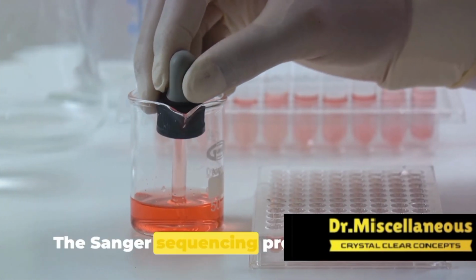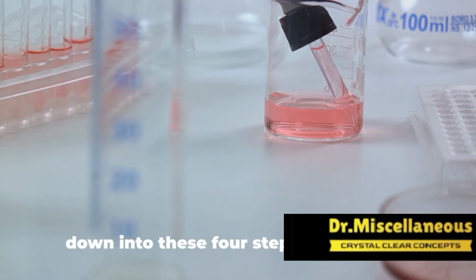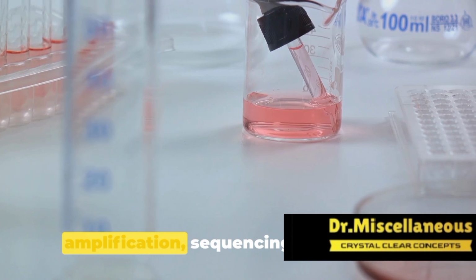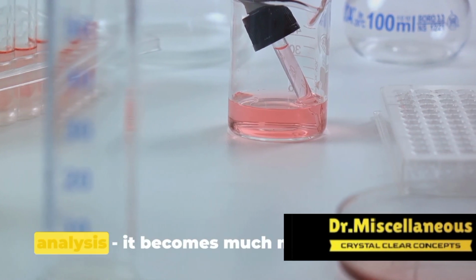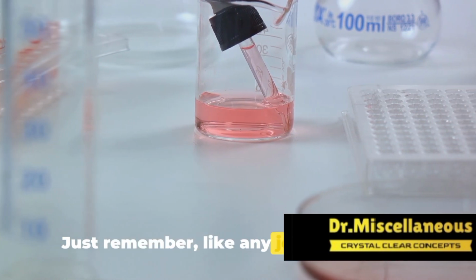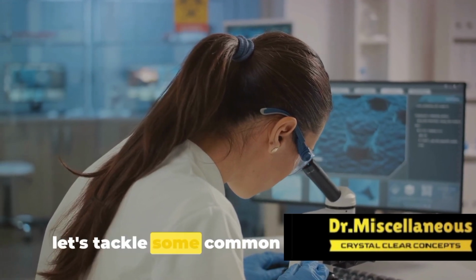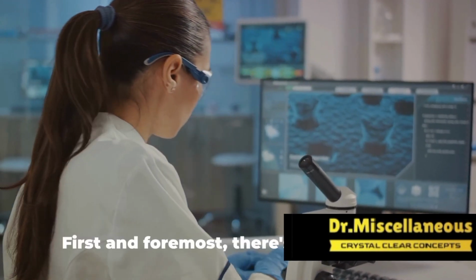The Sanger sequencing process may seem complex at first, but once you break it down into these 4 steps: extraction, amplification, sequencing reaction, and analysis, it becomes much more manageable. Just remember, like any journey, it's one step at a time. Now that we've understood the process, let's tackle some common misconceptions and difficulties.